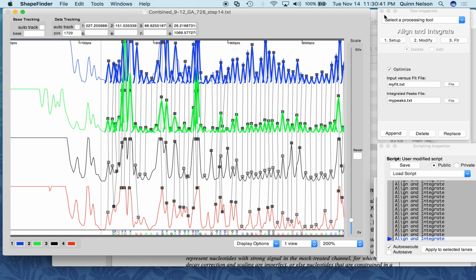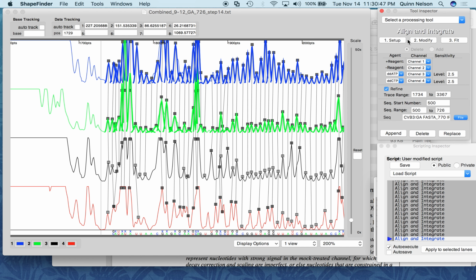So we're going to go back in, and this is how easy it is to redo this, guys. You'll go to setup. Don't change anything. You are good. Don't delete anything. Just go to setup.